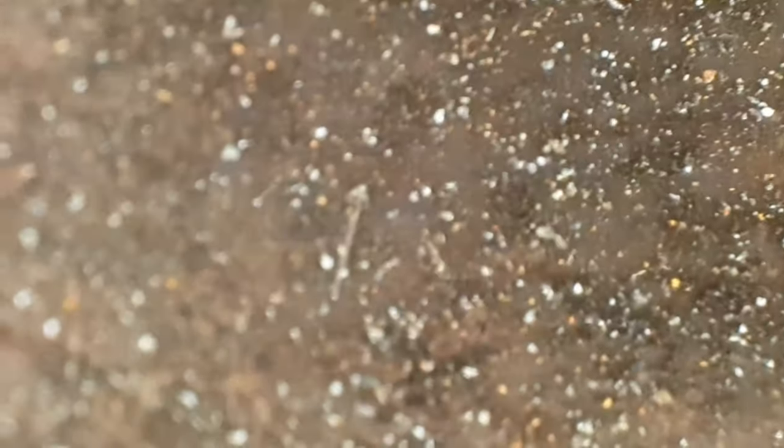There's a picture where it looks like a mammoth. And then if I turn the camera setting and you turn the light... is that a hair? What's that? That's a long crystal — but it could be a fibre of glass fibre. It could be a hair, like you say. We'll call it a long boy. We found a long boy. A certified long boy.